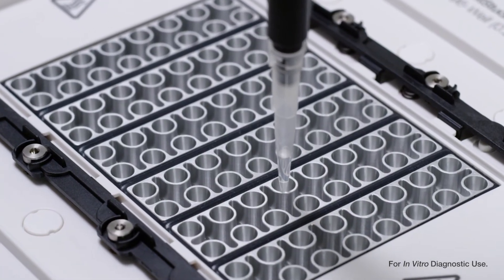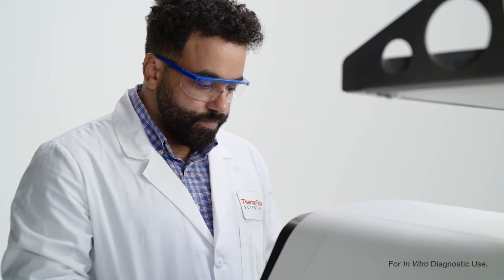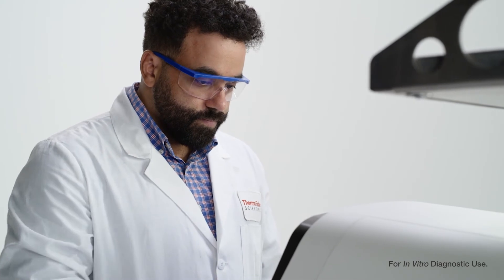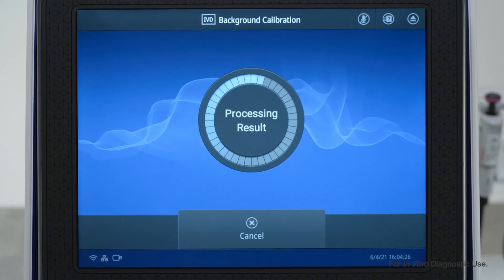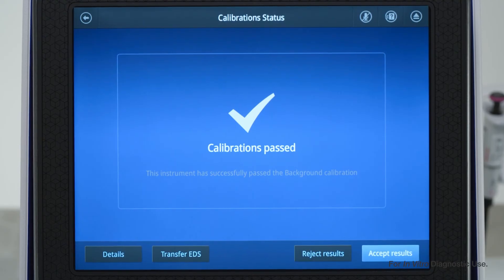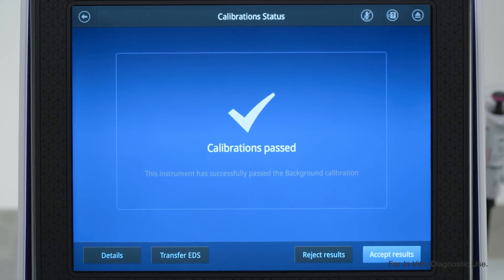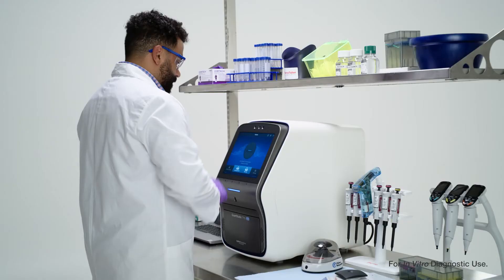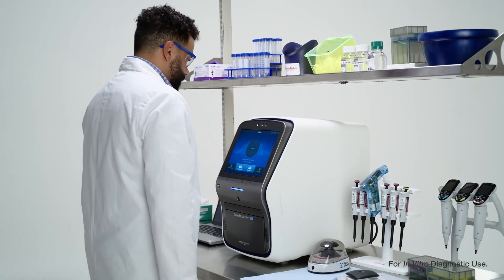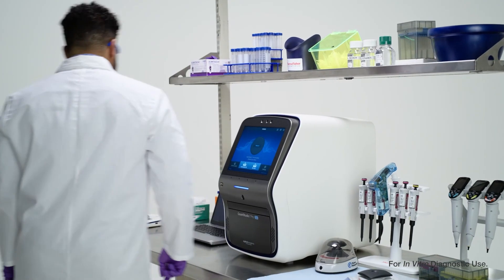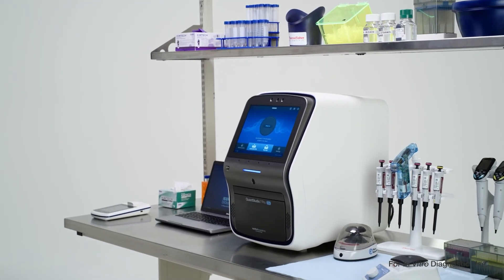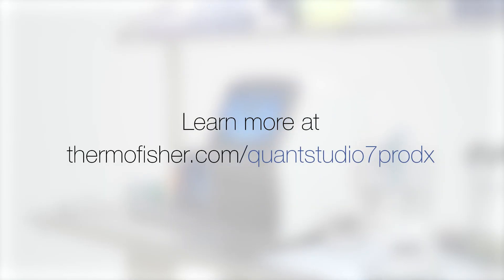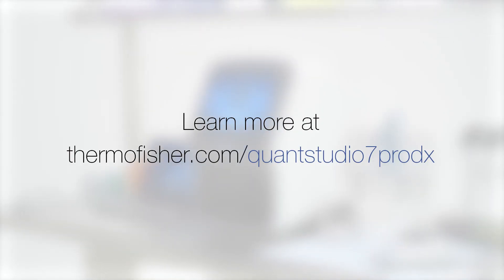If contamination continues to persist, contact Support using the Smart Help feature. And once the background check produces passing results, your workflow can resume with reliable, confident results. Learn more about your Applied Biosystems QuantStudio 7 ProDX real-time PCR system at thermofisher.com/QuantStudio7ProDX.